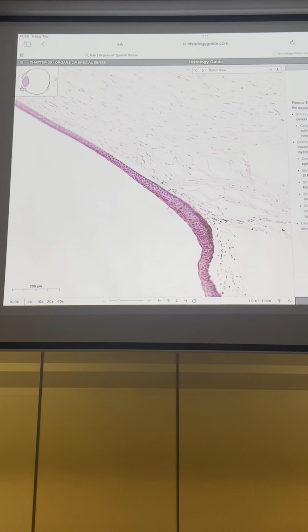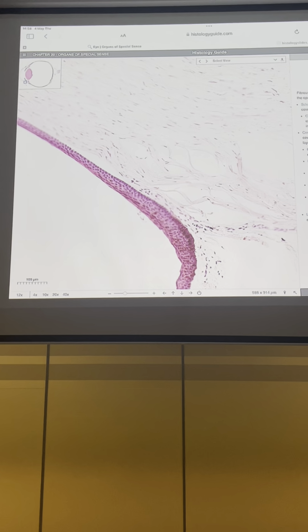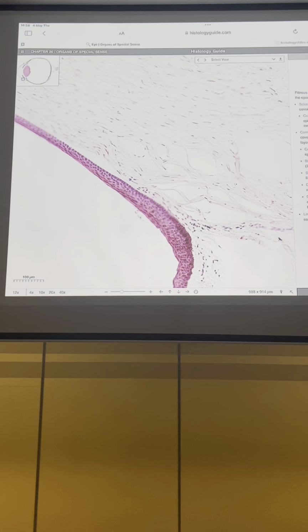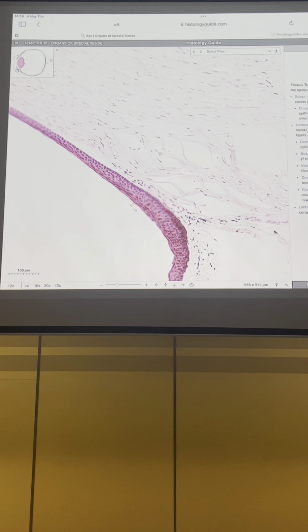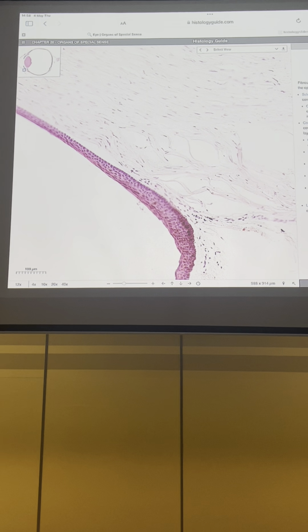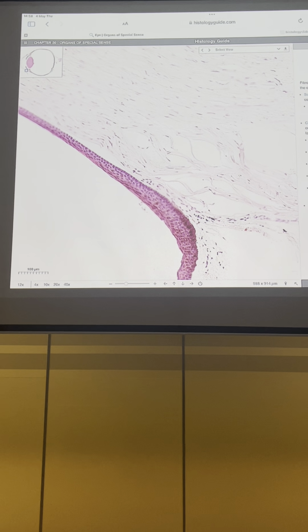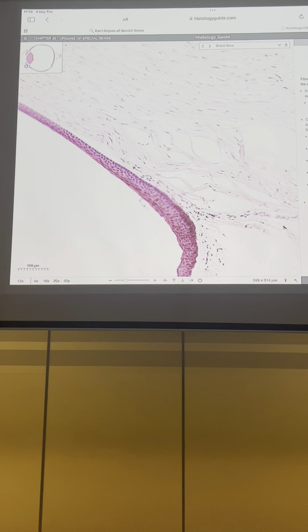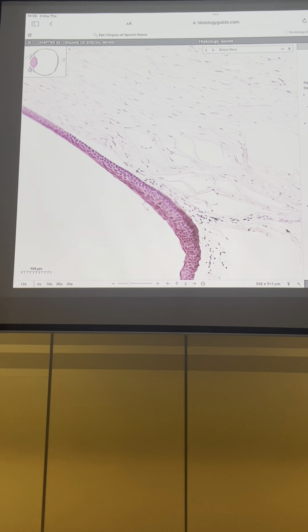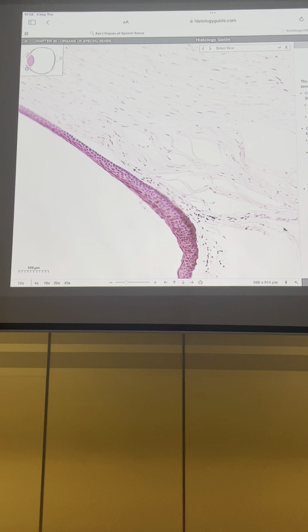And this intermediate zone is known as the limbus. In the limbus, we have networks of capillaries and sinuses which compose the Schlemm channels between the connective tissue of the limbus. Go to the next part.